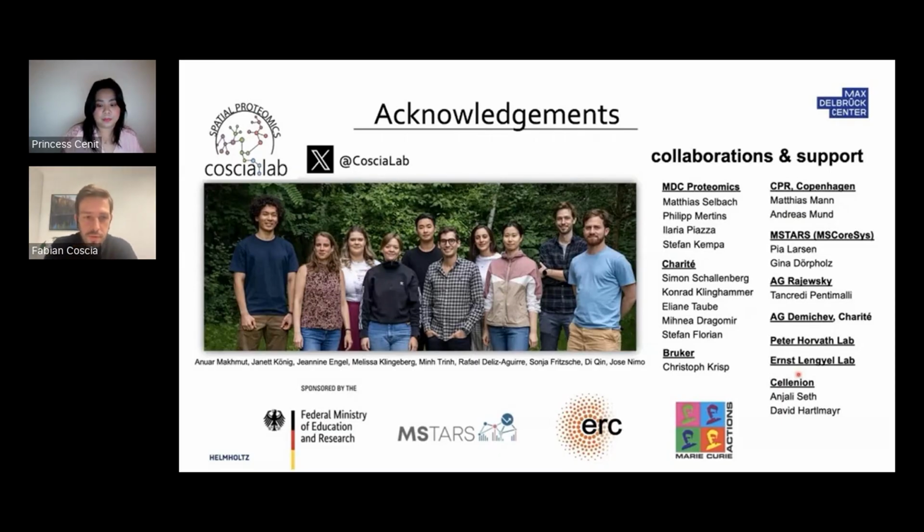Yeah, you're raising a very important aspect, and many people in the field have done this in the past, comparing frozen tissue samples to archival samples, and indeed, frozen samples are typically of better quality. When we measure a proteome, we can analyze more proteins and get a higher coverage. But this is not the most accessible type of biospecimen, right? If you look out there in histopathology labs, formalin-fixed and paraffin-embedded material makes up the majority of samples, right? So this is extremely important if you want to study many diseases.